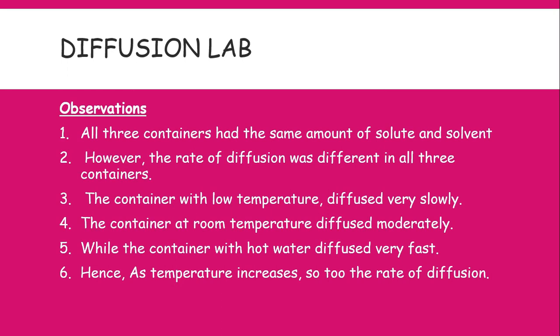That must be recorded in your observation, and you need to also record your timing. Those form part of your observation.